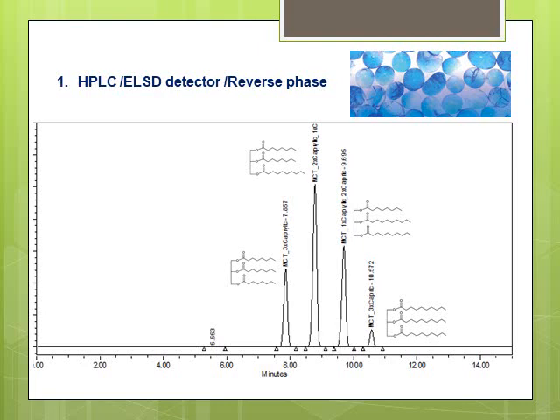That is, we can measure how much MCT we have in the formulation, and also by looking at the peak ratios among these 4, we can get information about the grade. So when you are doing reverse engineering and you want to figure out which MCT you should use in your formulation, or which grade of MCT was used in the product that you are trying to reverse engineer, you will look at the peak ratio and make comparison and make a decision.